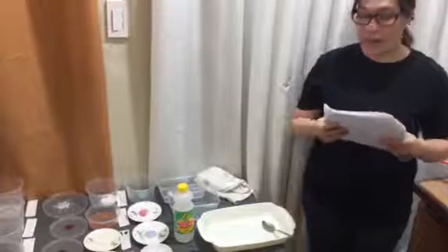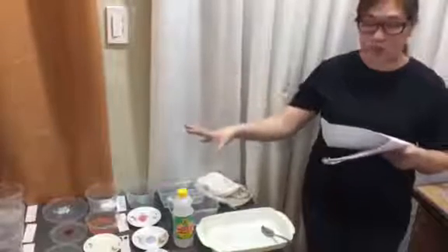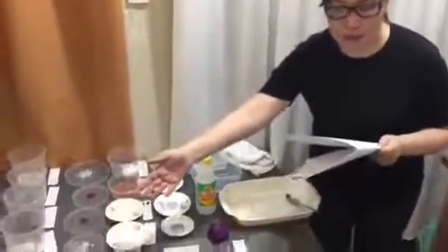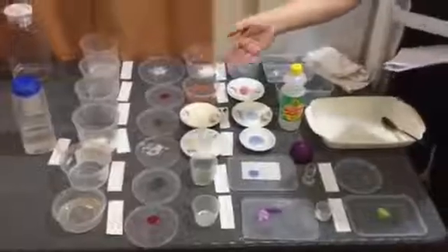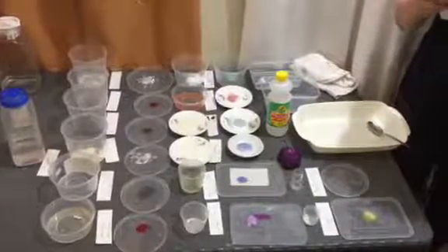So, household items. Now, let us identify whether those products are acid, base, or neutral. Lemon juice, as you can see, is an acid. Soapy water is a base. Drinking water is neutral.